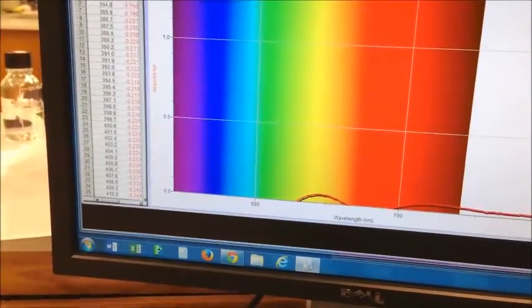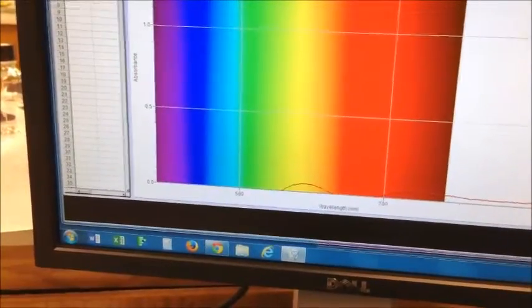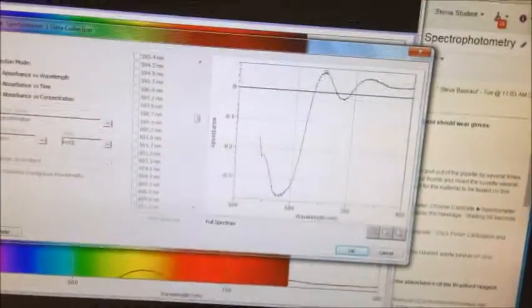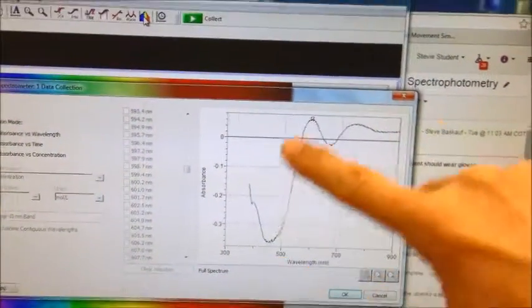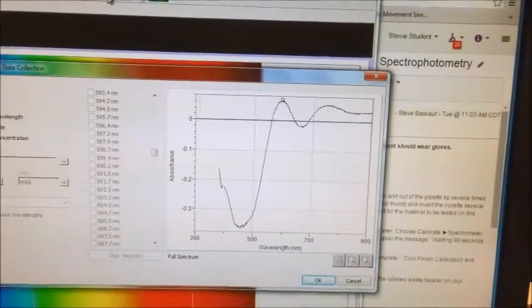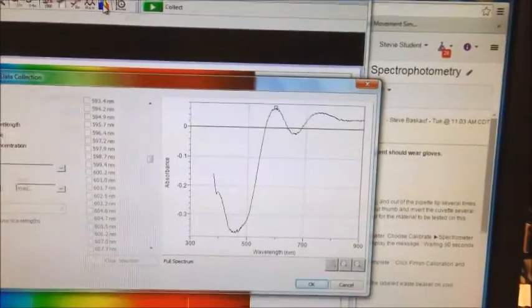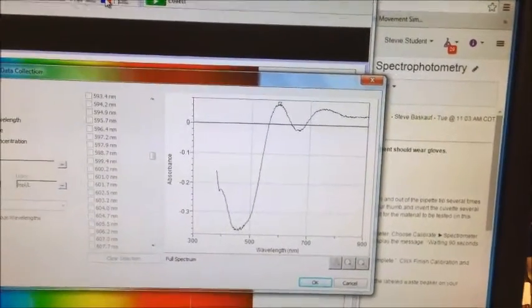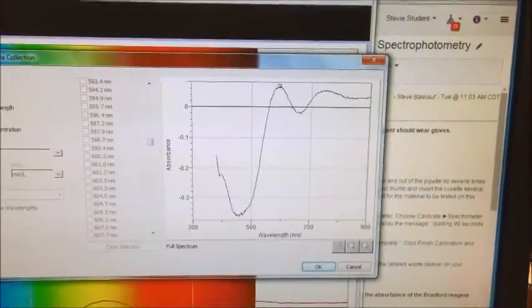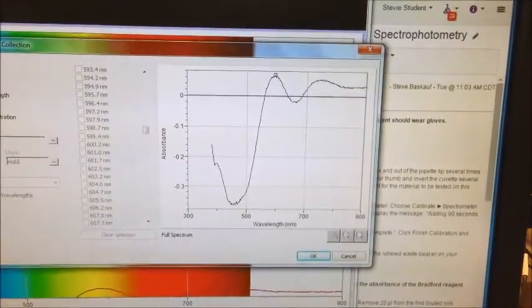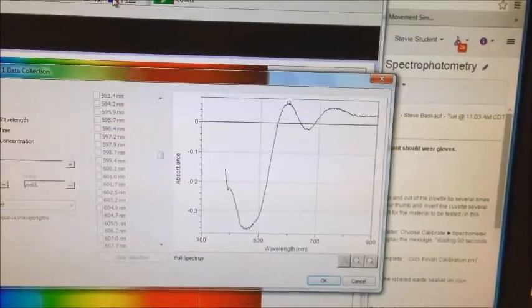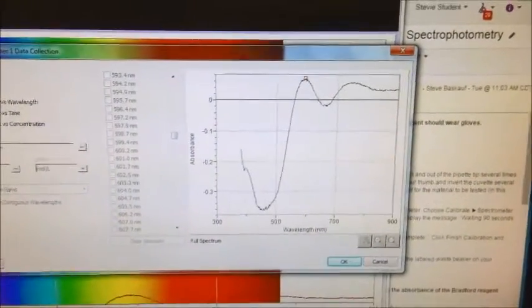So I'm going to tell it to stop, store latest run. And when I click on the little rainbow spectrum button up here, I can see what the result is when the spectrophotometer subtracts the calibration absorbance at every wavelength from the absorbance that happens when the blue reacted Bradford reagent is in the tube. So you can see that at this wavelength that value is positive.